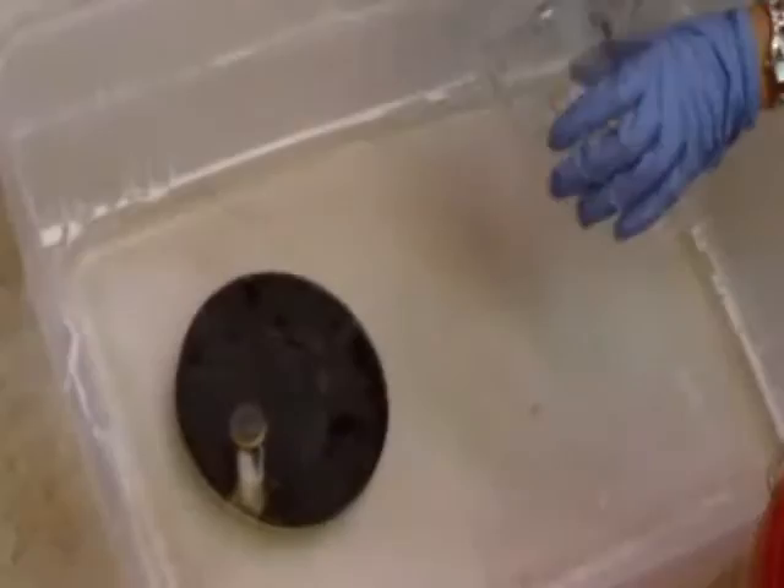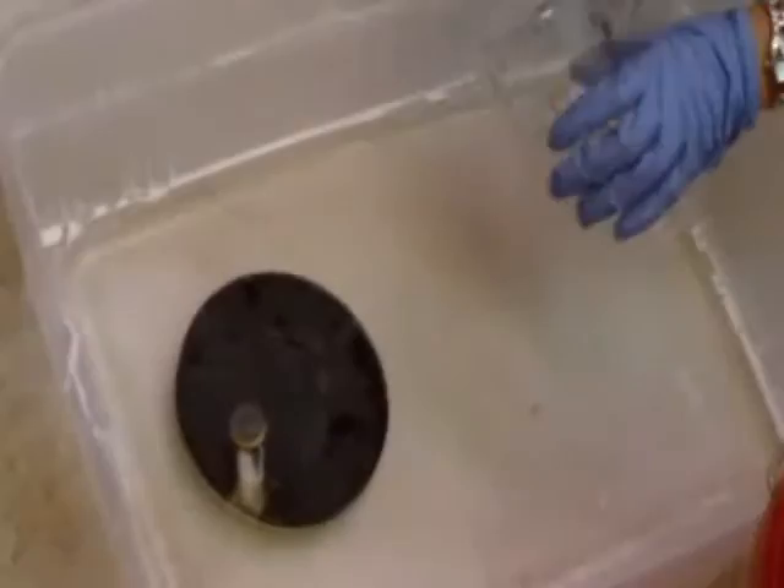Next, I bring my ants down the hall to the ant room and introduce them to their new homes. Lots of things happen in the ant room. Lab colonies are stacked almost to the ceiling. These are the buckets I use out in the field to collect my ants. The ant colonies always have water tubes in their boxes. I feed them two crickets three times a week to keep them happy and healthy while getting things ready for my experiment.